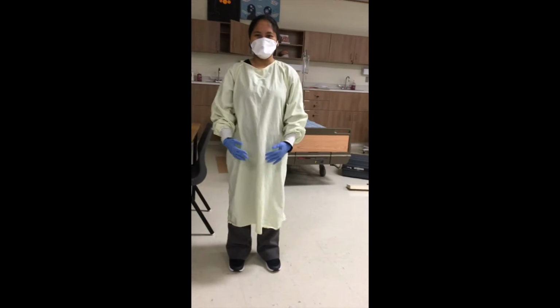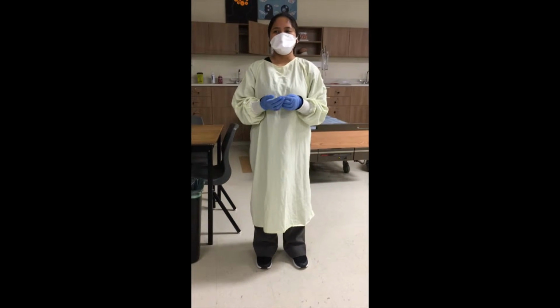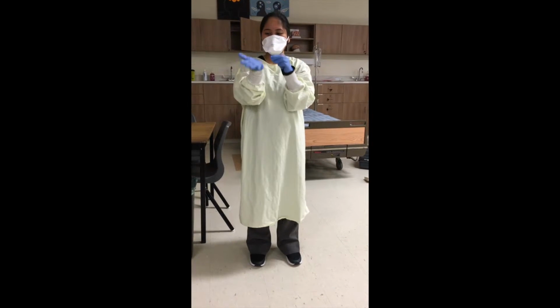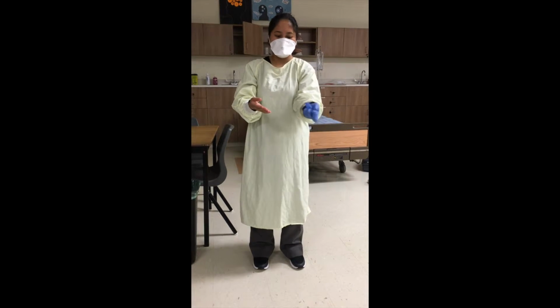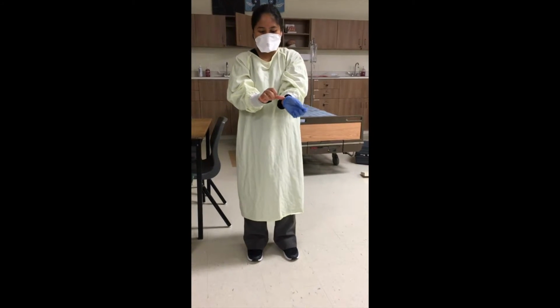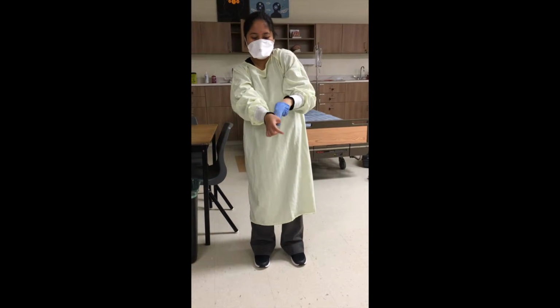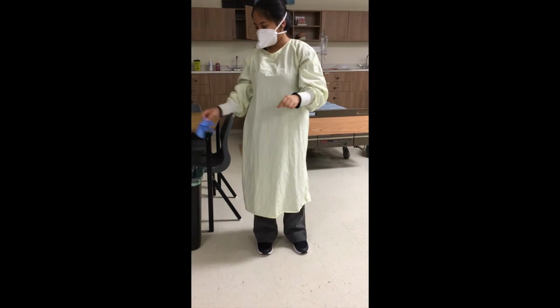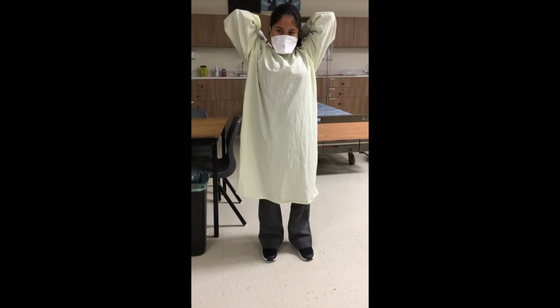Okay, so I just came back from an airborne isolation room. So we take off the most contaminated to the least. So first we start with our gloves. We pinch this part, pull it into a ball with our other hand, and then get it with your thumb from underneath, and then try to put it in so that you don't touch the dirty area. Then we untie our ribbons from the back.